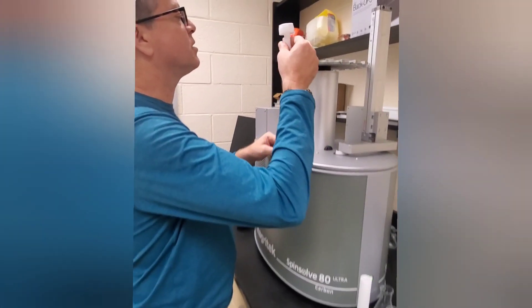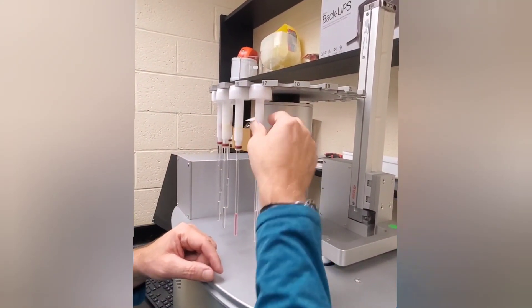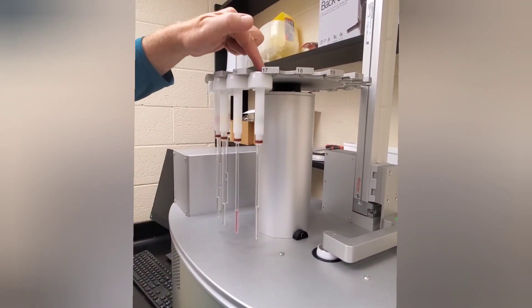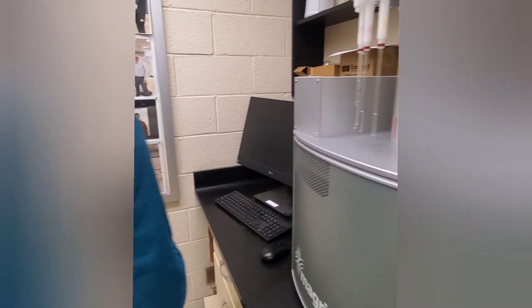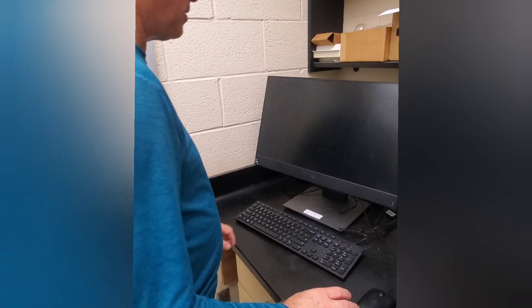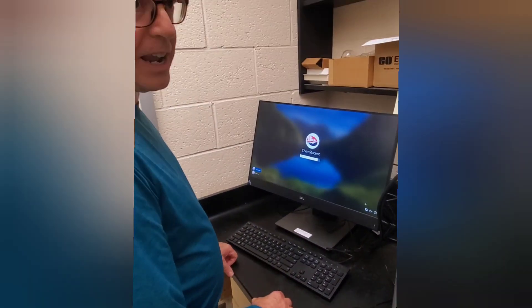Now we're going to place this into one of the sample slots. I'm going to place this into slot number 17 — you can also read the 17 on the top here if you're not sure of the position. After that we have to get into the software, and the password for this is 'organic chem'.